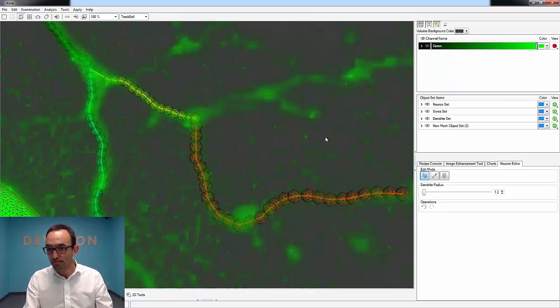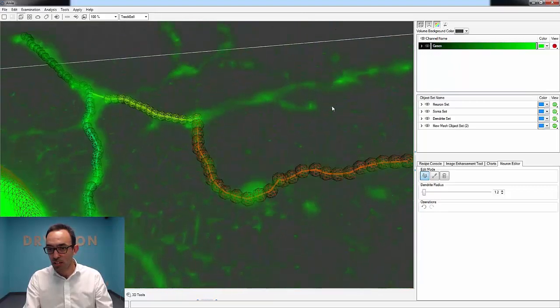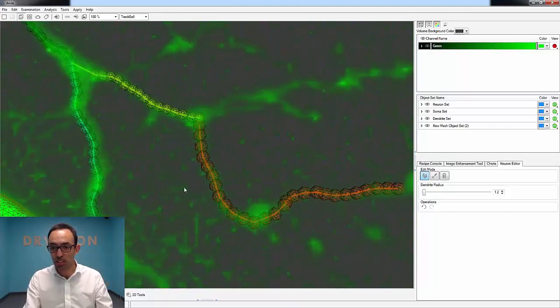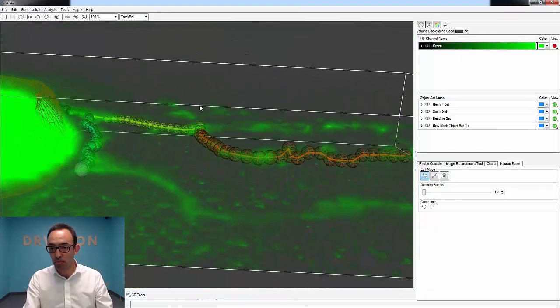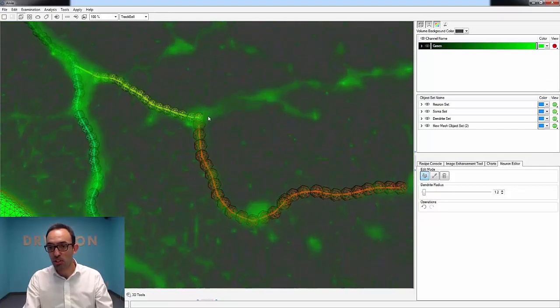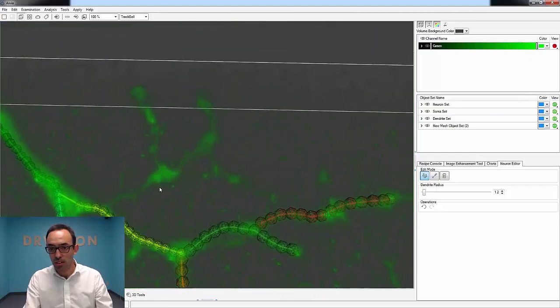and this has drawn that segment in 3D space, and it ignored all that background that you see at the back of the image. You can draw a few other segments here, one here, here. Just going to draw all of these.